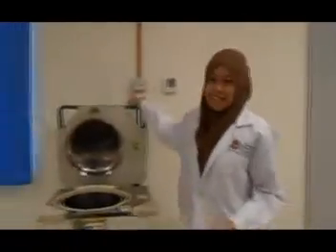I wonder what is autoclave and how it works. Let me explain it to you. Autoclave is a machine. This is autoclave machine. And what is actually autoclave? Autoclave is a device that uses moist heat in form of steam under pressure to kill off all living microorganisms on any object or any surfaces within it.